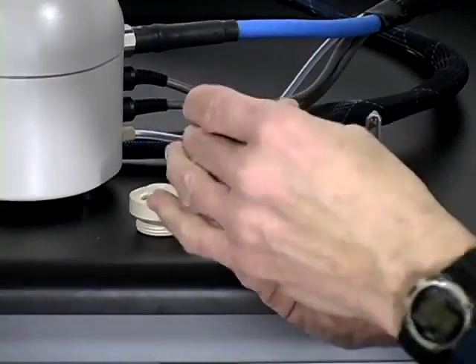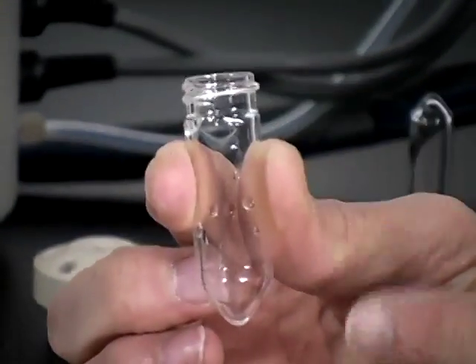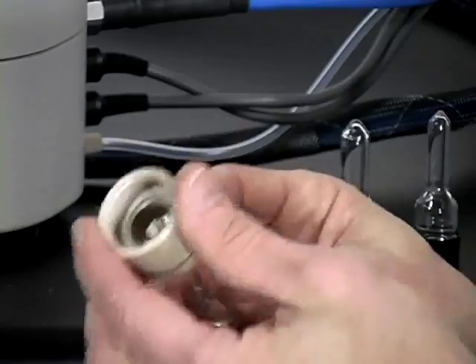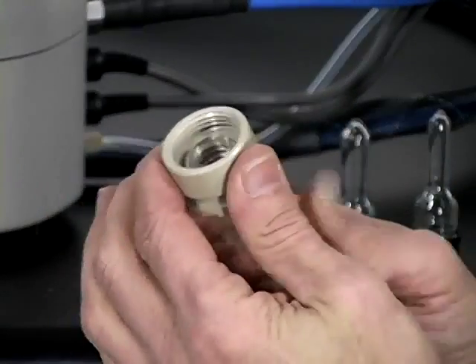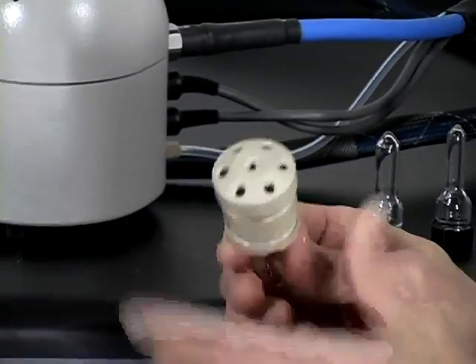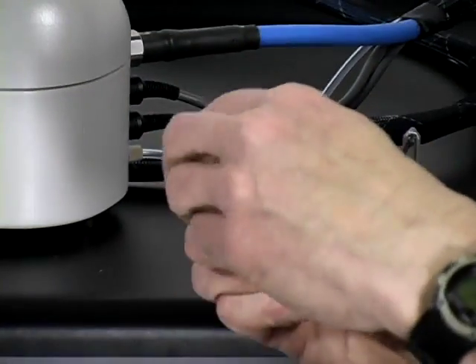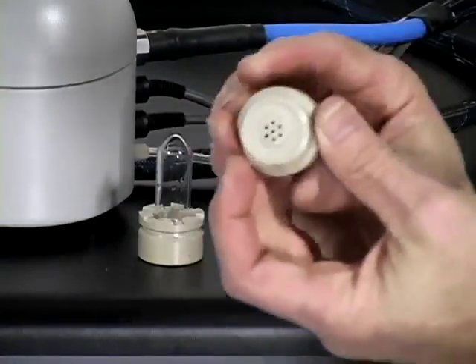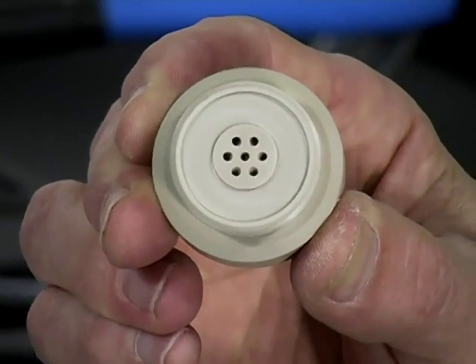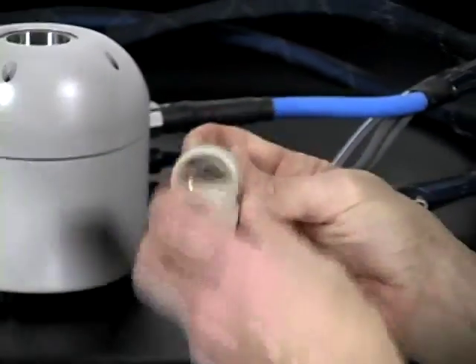The 4 mL vessel has the same opening and conical bottom. The multi-port PEEK head is two components: the first screws onto the vessel, and then the multi-port head screws on top of that. There are seven ports that lead inside the vessel. Looking at the underside, there are seven inlet ports — more than enough to cover your needs in terms of addition, removal, vacuum, and gas addition.